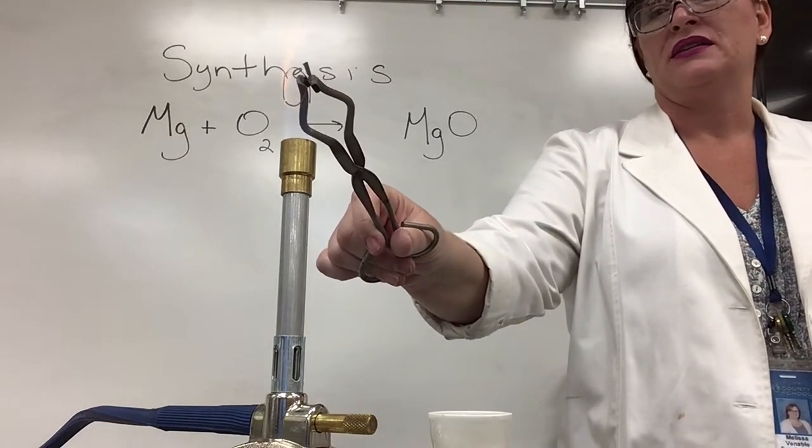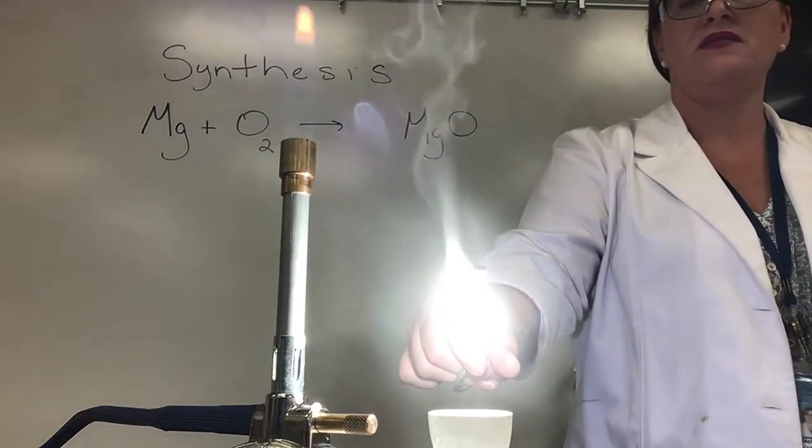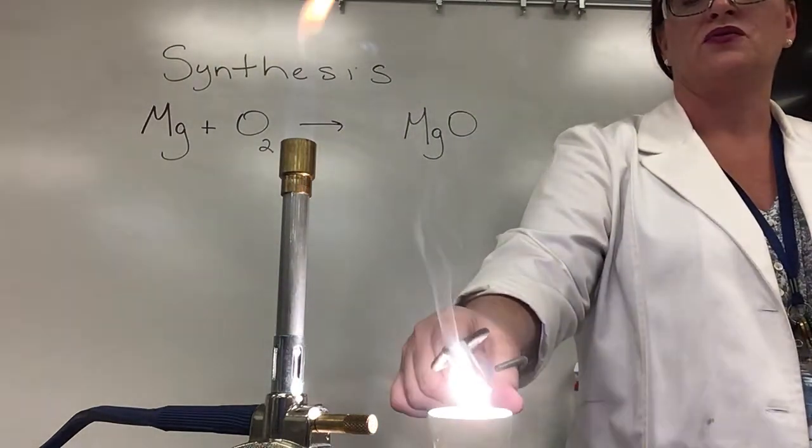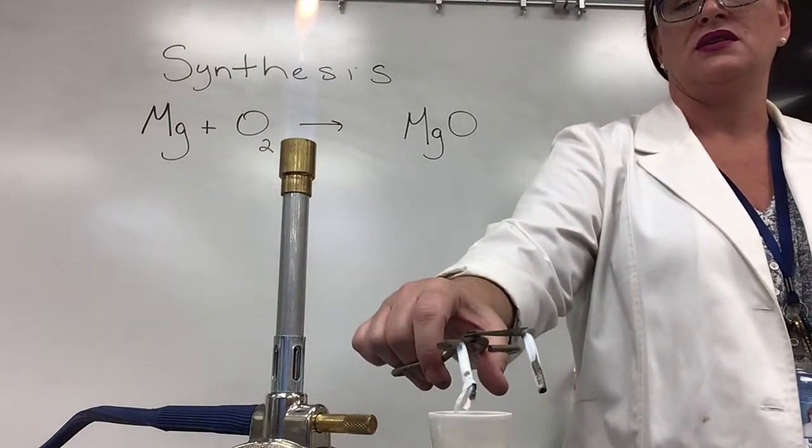This is the synthesis and it flashes that white color and I'm gonna drop it into my crucible and let it do its business.